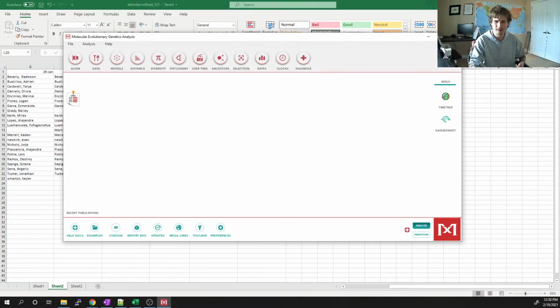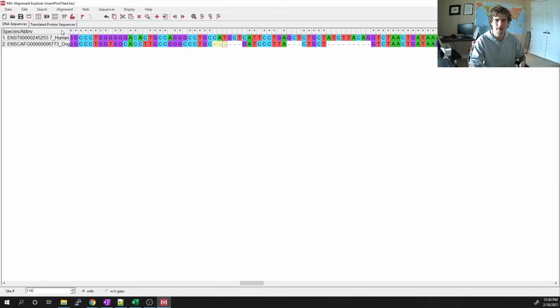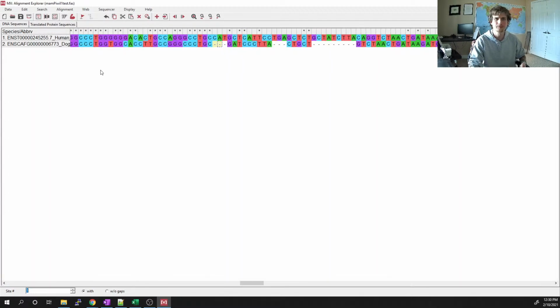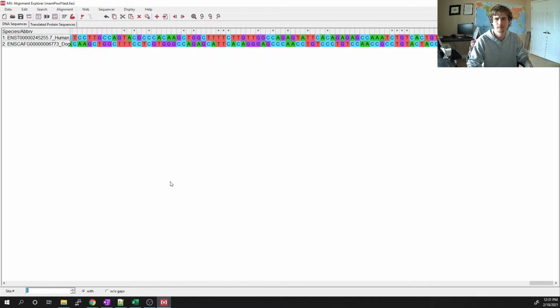Anyways, back to our MEGA stuff. So I'm going to get rid of this just in case it's weird. Yeah, let's see what happens. Okay, nope. Okay. Now we have our codon alignment again.